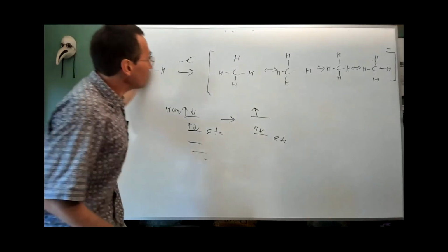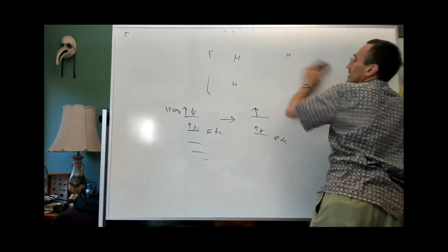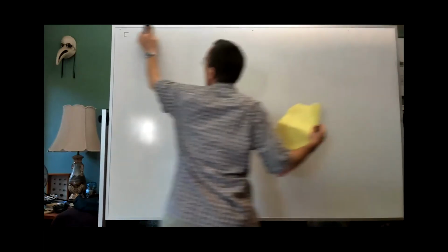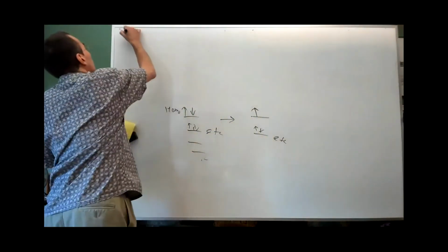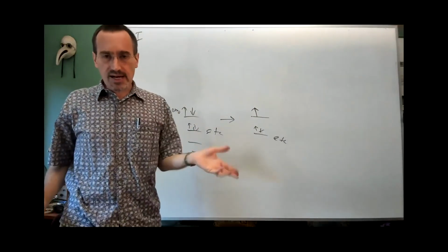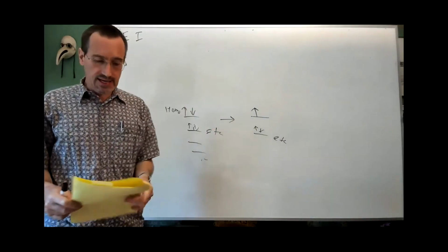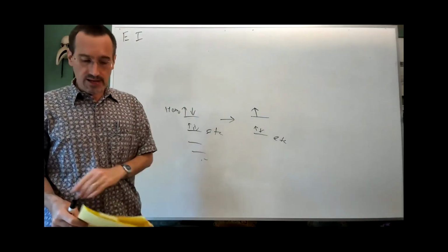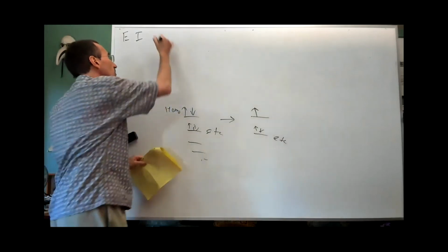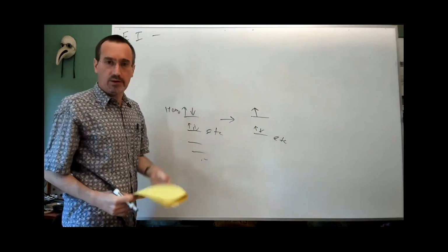And what really is the killer, though, with EI is not only are you making do with fewer electrons, which might not be so bad in the case of, say, an ether where you're kicking it out of a non-bonding orbital, but you've heated the molecule and you've given it a good hard whack with an electron.